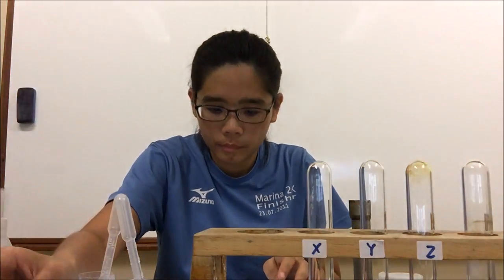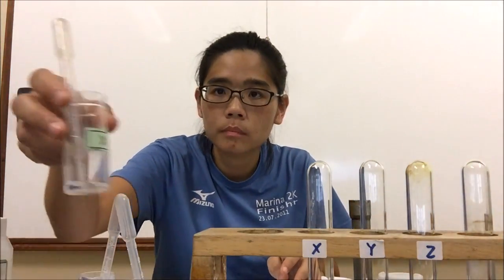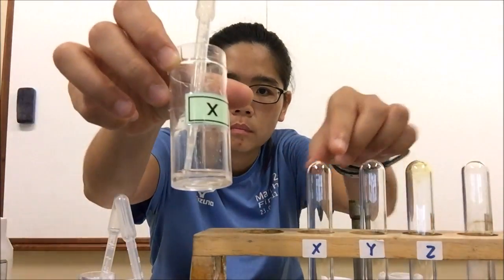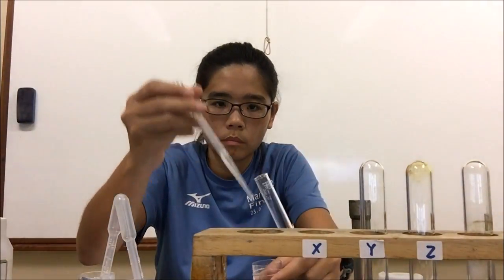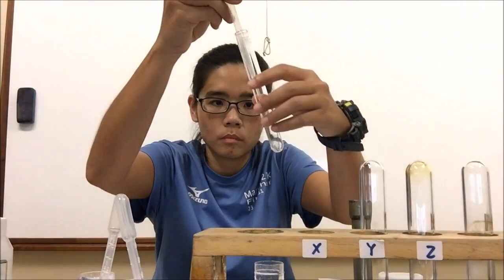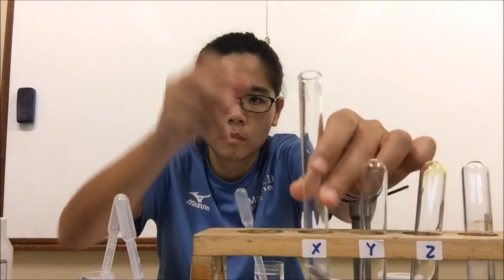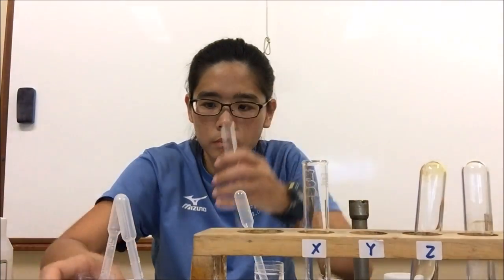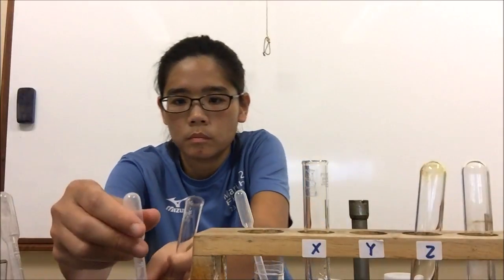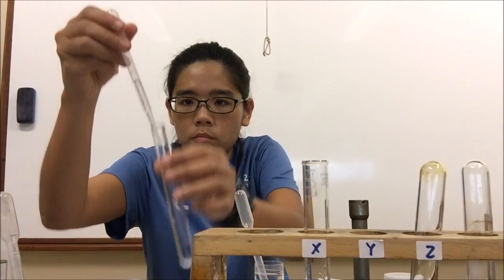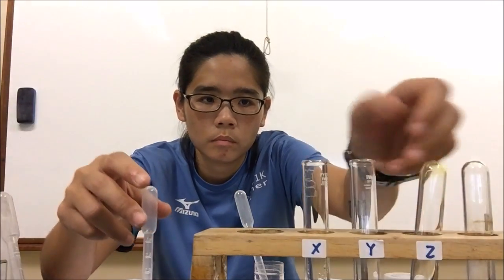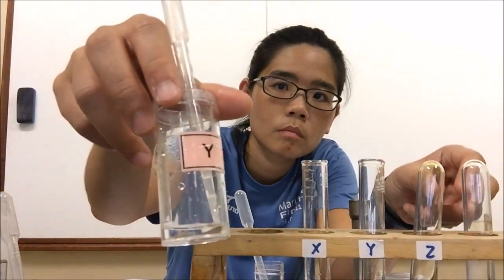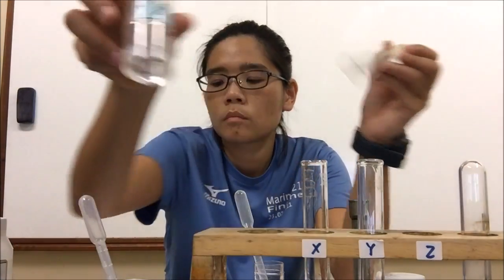I add 1 cubic centimeter of solution X into a stoop, then 1 cubic centimeter of solution Y. I put the droppers back in the bottle so that I don't contaminate them — one dropper for each solution. I also add 1 cubic centimeter of solution Z. So prepare equal amounts of each of the solutions.